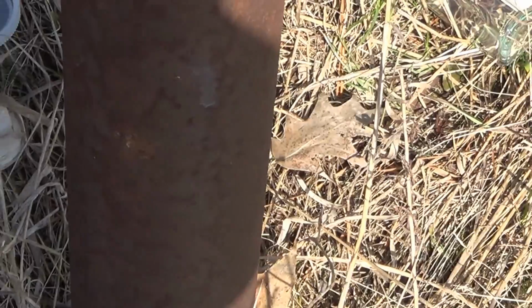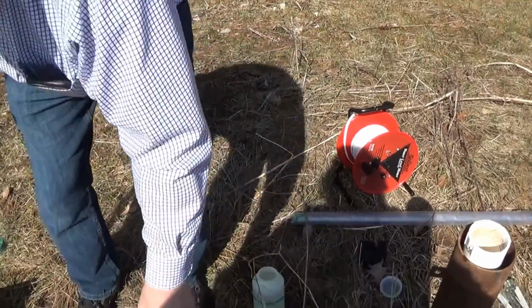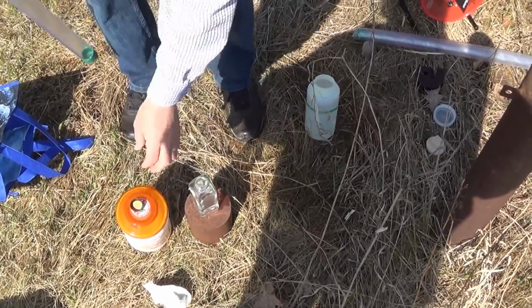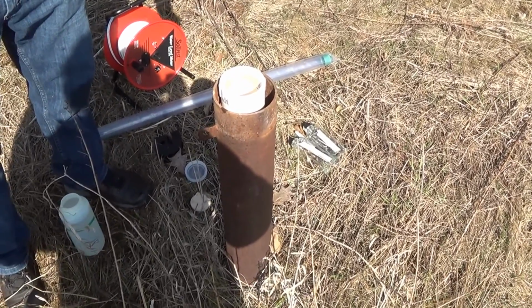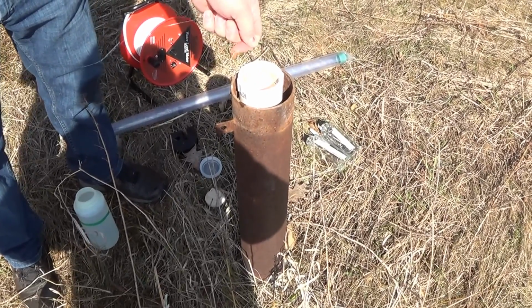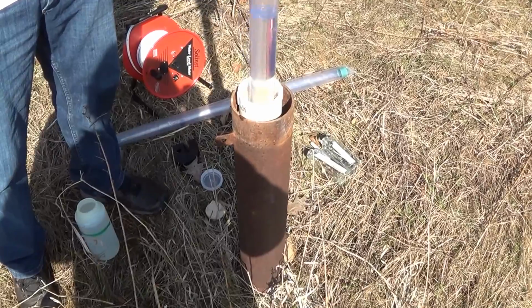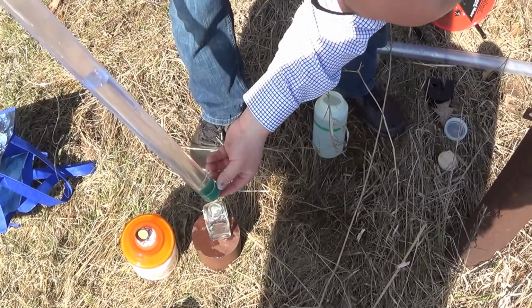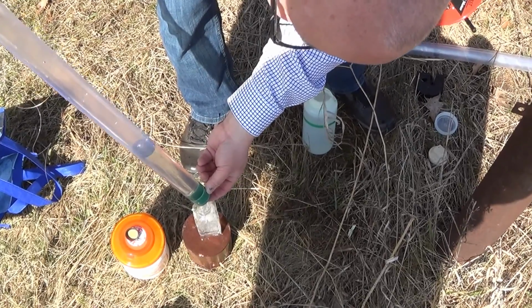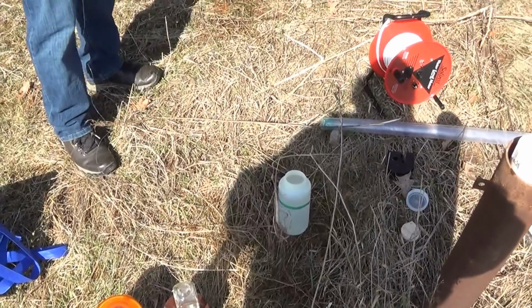We get a little bit for E. coli. Maybe we should have pulled it for this one first, right? To not have contaminated our baler at all. A little bit there. Just got a little bit in the bottom here, and we will let that. Well, I should have some gloves on. Disinfectant. Pull that in. I might be contaminating that sample without some gloves on. Good. And that's the sampling and the baling.